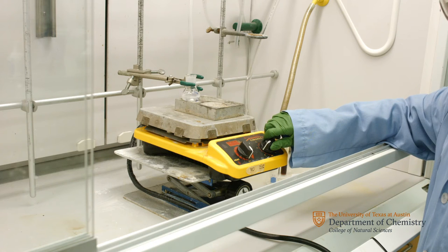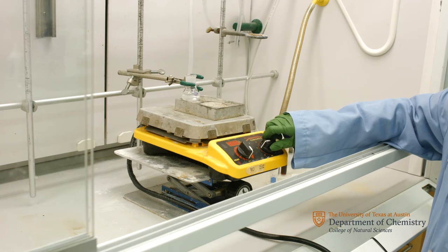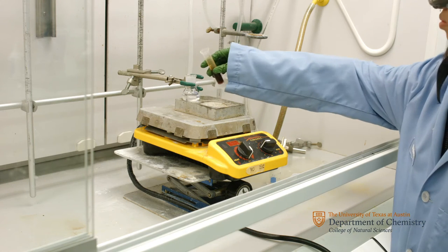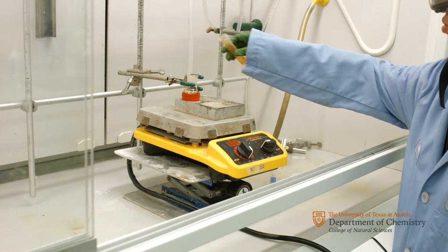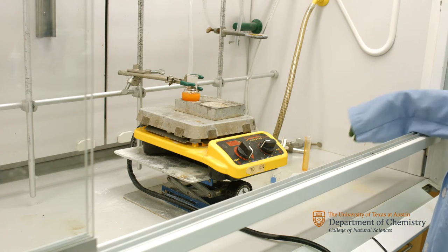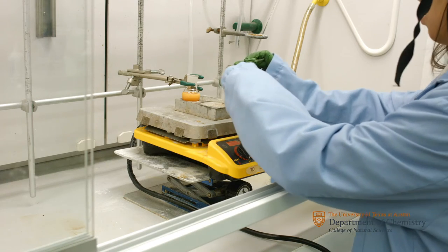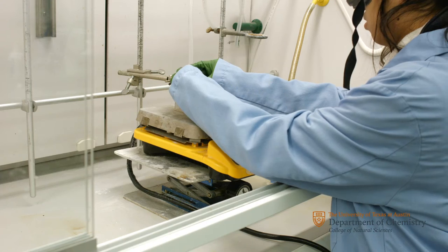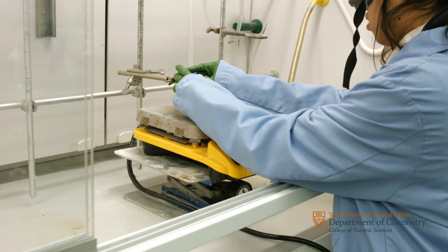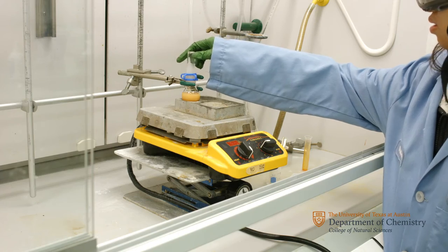Turn on the stir plate to get the stir bar spinning. When the E-stilbene has dissolved, add the 5 milliliters of bromine. Now place the Keck clamp onto the flask and then loosely place the stopper on the top. Continue stirring until the red color has disappeared and a white precipitate has formed. This should take about 10 to 15 minutes.